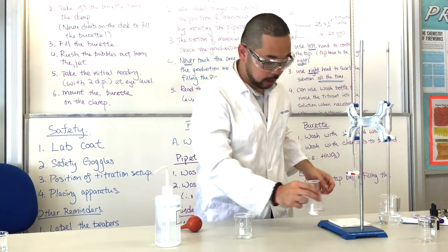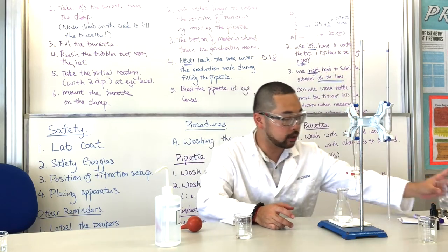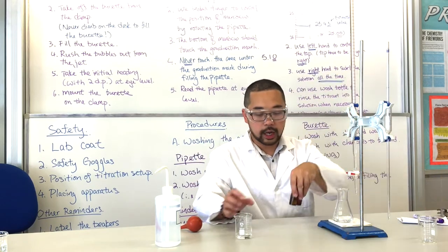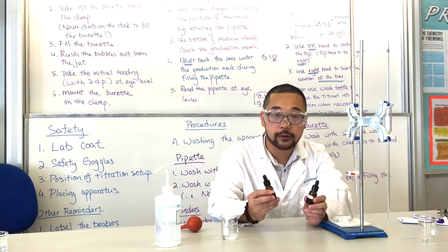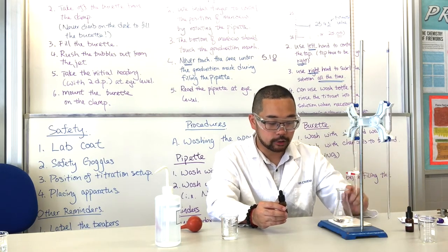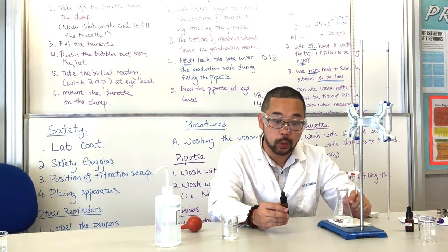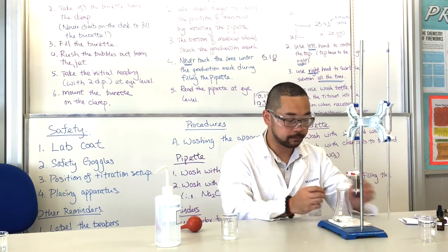So when both liquids are ready, what you need right now is to add a suitable indicator. During the practical exam, you're going to be provided 2 indicators. One is methyl orange, one is phenolphthalein. As this one, we are using nitric acid titrated against sodium carbonate, which is a weak base, so we are going to use methyl orange.